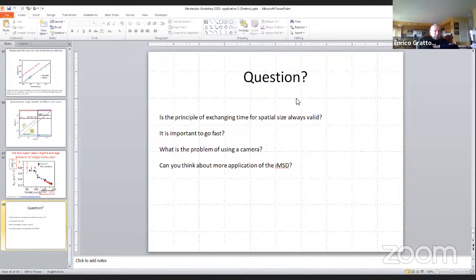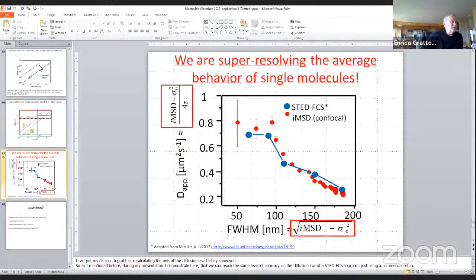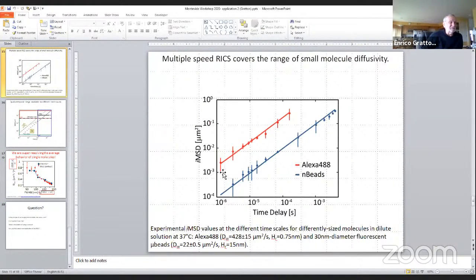It's the size of the chip. So you are very much limited because you can go a factor of 500 there. And even if the camera is 1,000, generally you can go slower than the camera. But it's limited here. If you see the number of decays you have, it's 1, 2, 3, 4.